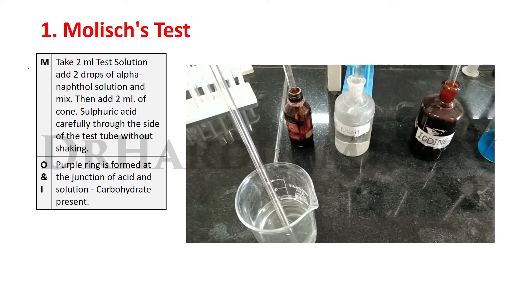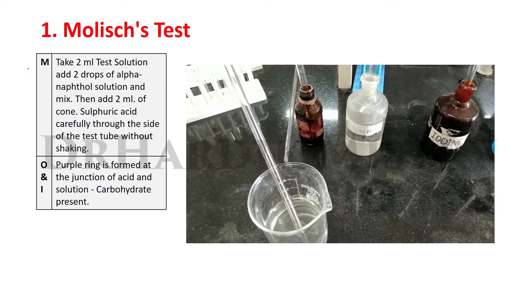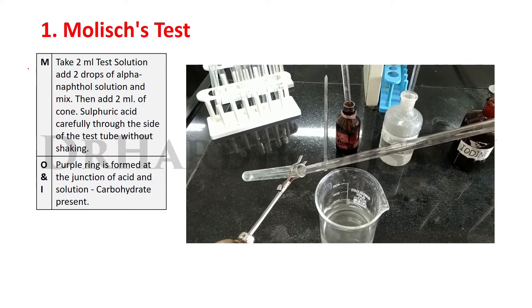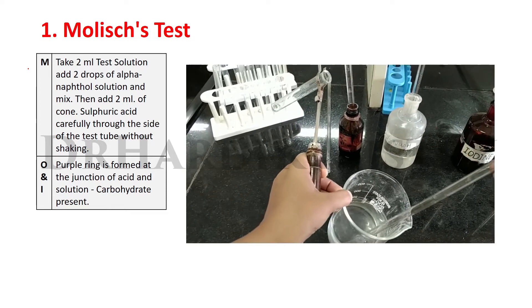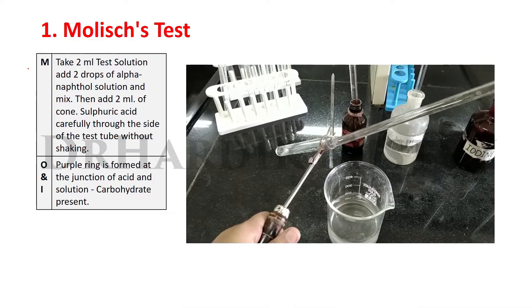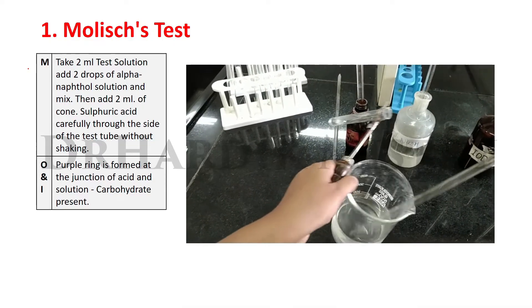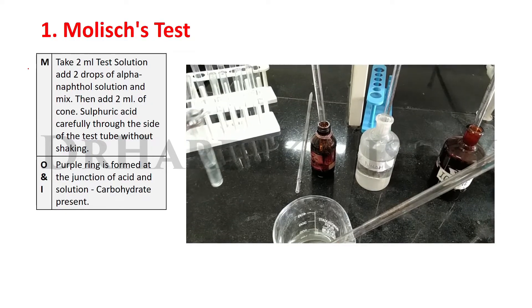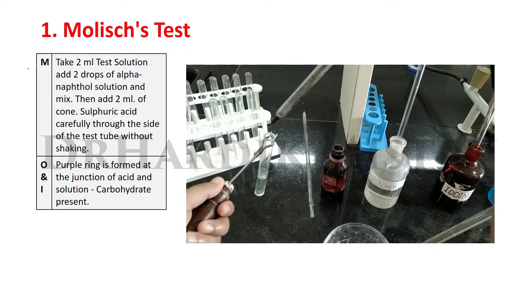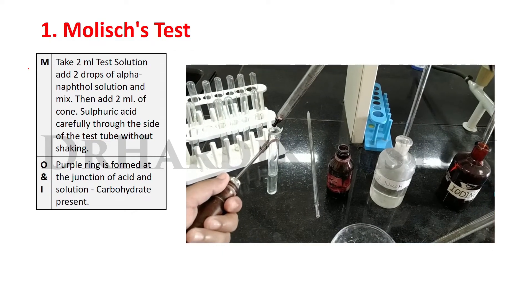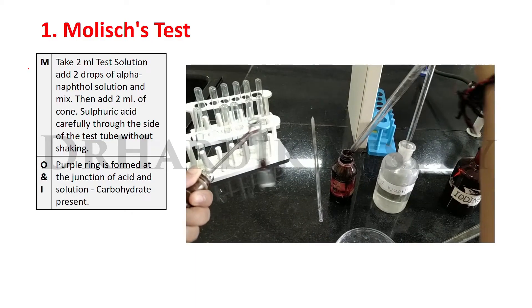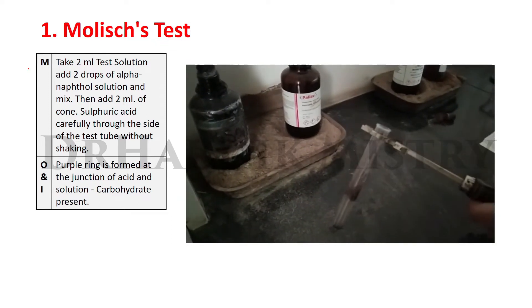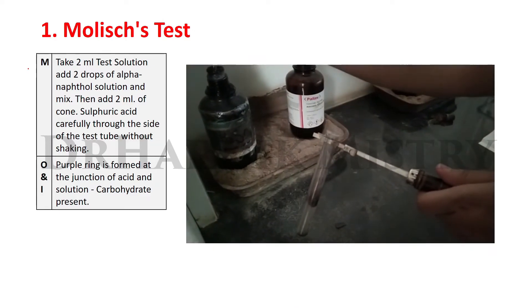Method: Take 2 ml test solution. Add 2 drops of alpha-naphthol solution and mix. Then add 2 ml of concentrated sulfuric acid carefully through the side of the test tube without shaking.